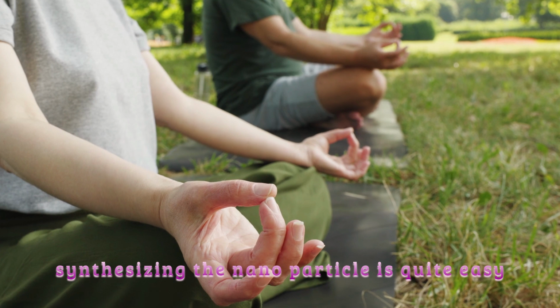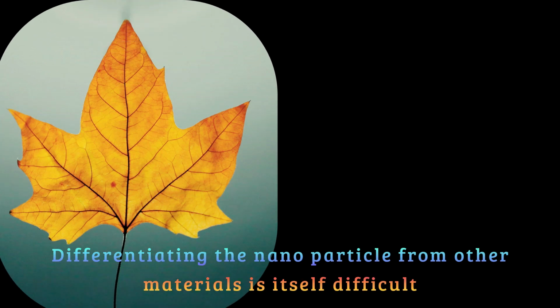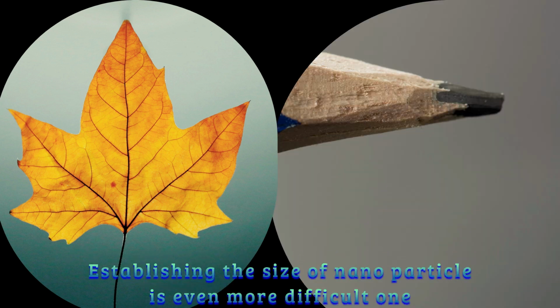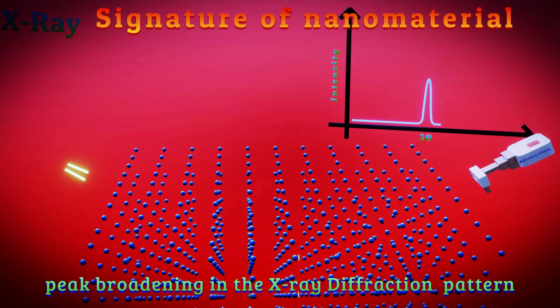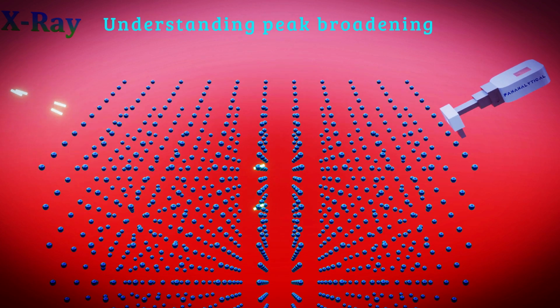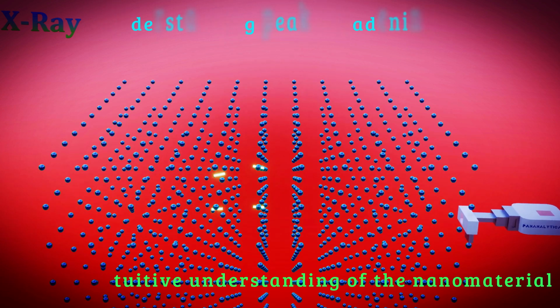Synthesizing nanoparticles seems quite an easy task, but studying them is much more difficult due to their small size. Differentiating the nanoparticle from other forms of materials is itself a difficult task. Establishing the size of a nanoparticle is an even more difficult one. The most apparent signature of nanomaterial is the peak broadening in the X-ray diffraction pattern. Understanding the origin of such peak broadening in crystals provides us an intuitive understanding of nanomaterials.